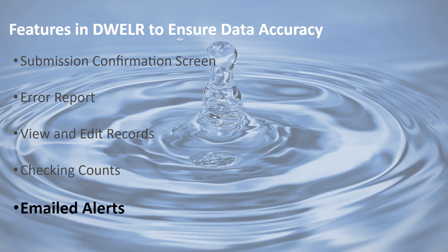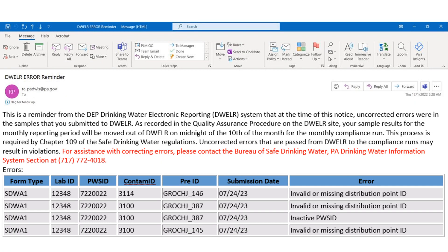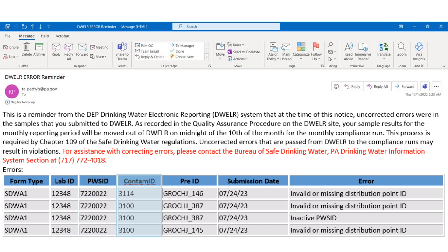The final DWELLR feature we will talk about are the emailed alerts that DWELLR will automatically send to you. DWELLR will send emails on the 1st, 5th, and 9th of the month to every user associated with your laboratory ID if any data submitted into DWELLR that reporting period has errors or warnings associated with it. The table in the email has 7 columns which will help you identify where the error has occurred. The columns include the form type, the entered laboratory ID, the PWS ID, the contaminant ID, the record ID, the date the data was submitted into DWELLR, and the error message.